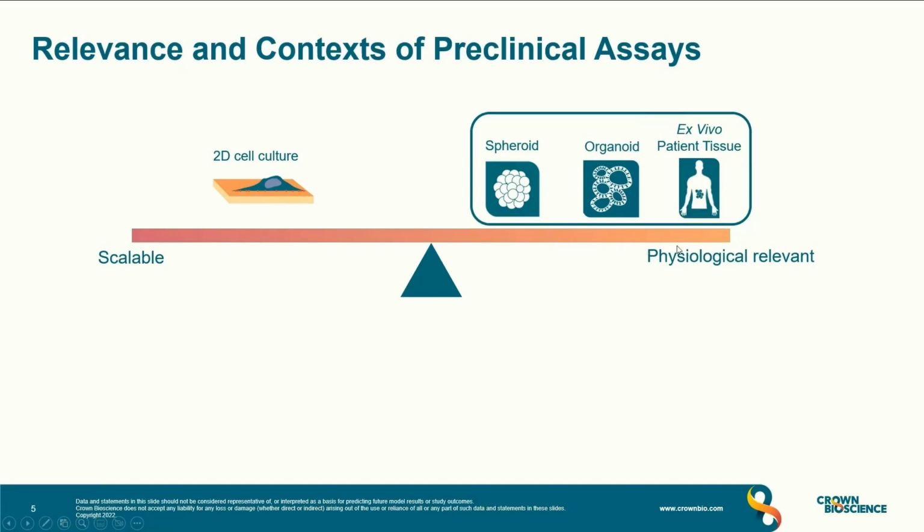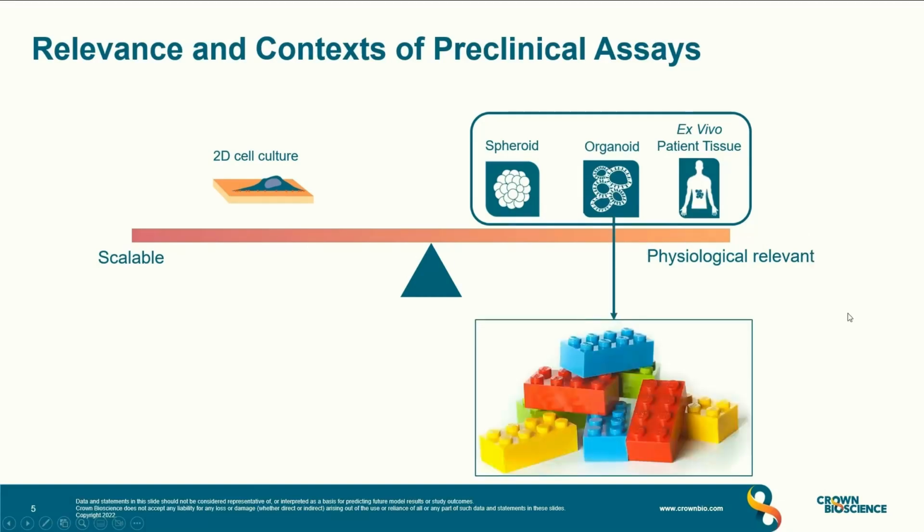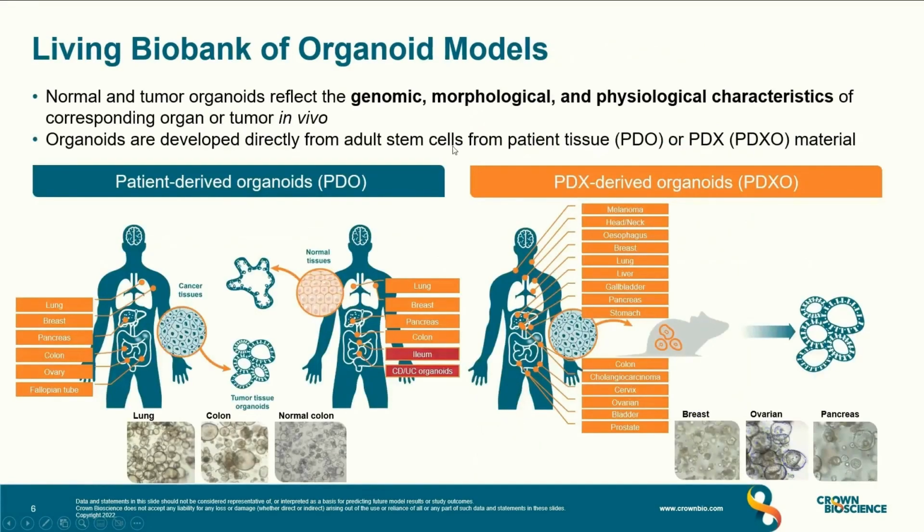So I want to, in this talk, take a step back from the ex vivo part and focus on how we can use organoids in a Lego-like fashion to model the diseases that we are interested in, introducing different kinds of context and cells in these cultures. So first, a quick recap on what organoids are.